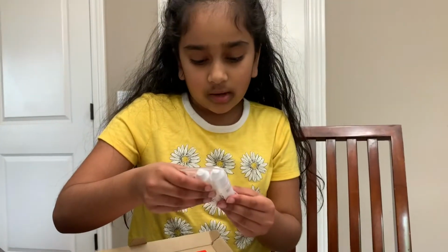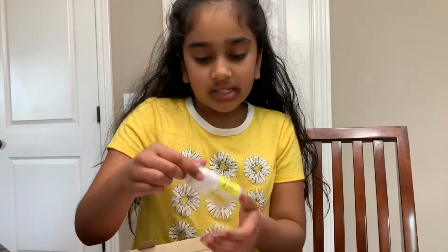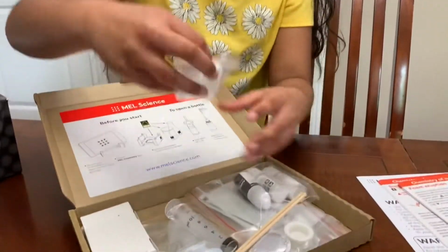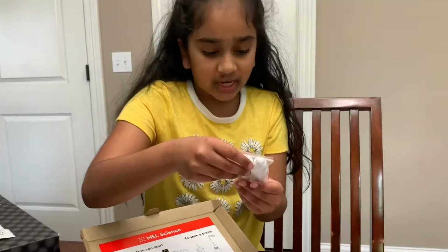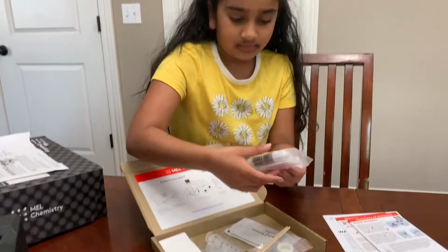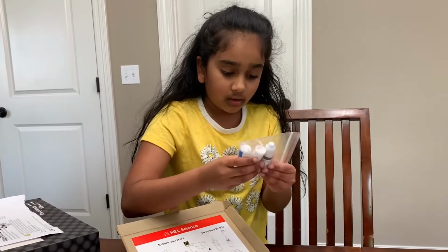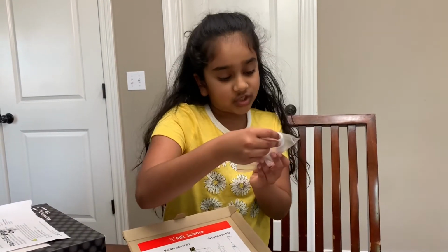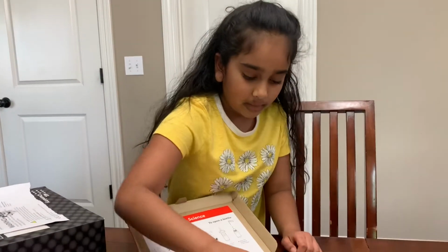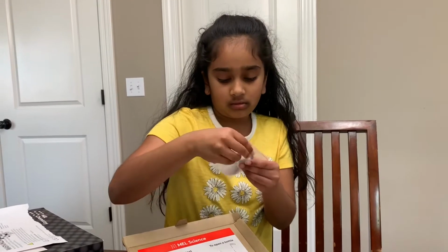They're sodium hydrogen carbonate. This is basically baking soda. This is also, it has another copy of that. This is citric acid and sodium carbonate. This is food coloring, and this is citric acid, and another pack of sodium carbonate right here. This is some solid fuel.